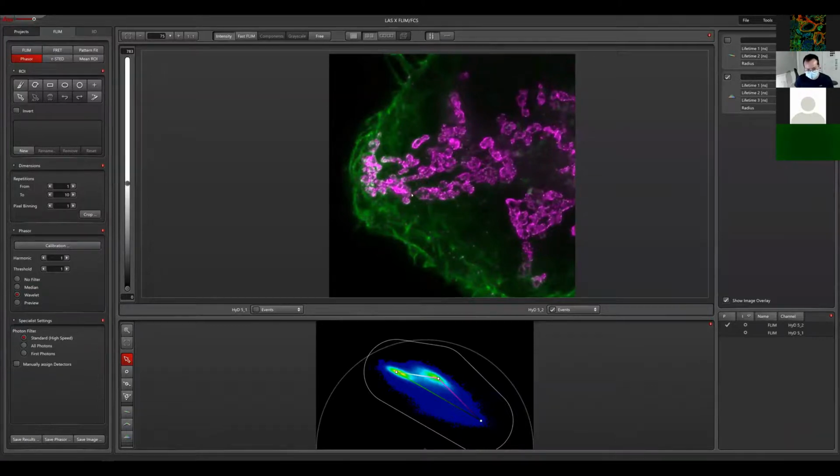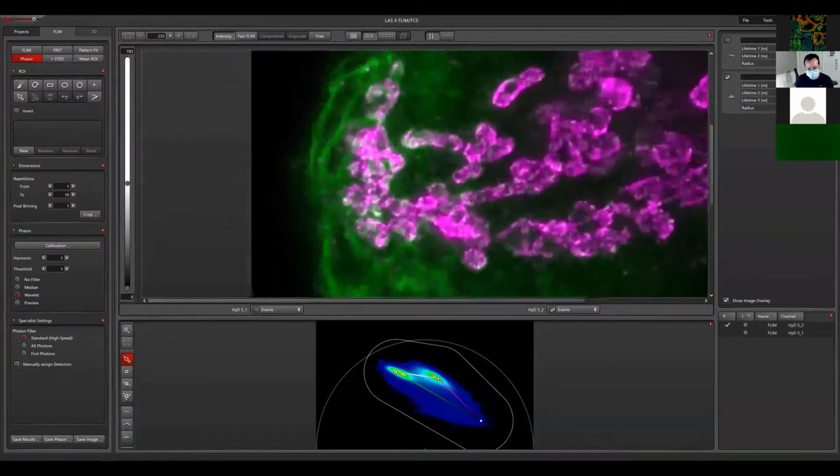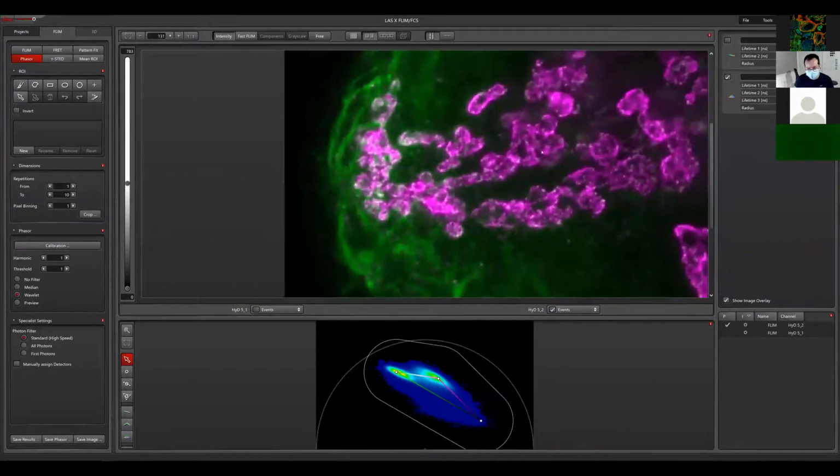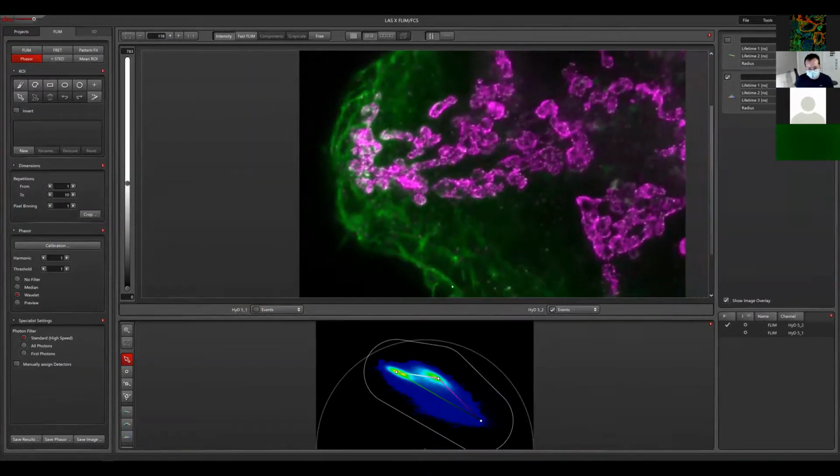Of course, the filtering is not as good as it was supposed to be. And here you can see in the overlapping structures, sometimes I have some kind of artifacts. But I think as a first approach, it works really nicely.